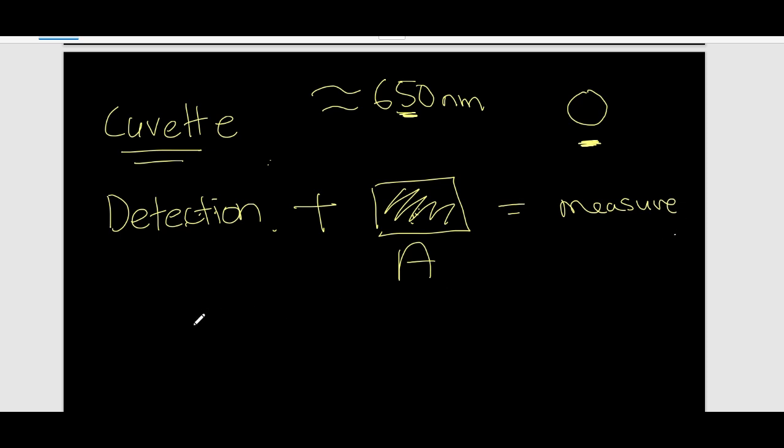I have written in your procedure to use 1 ml of detection agent and 2 ml of the phosphate or standard solution, which I can generally call the sample. So the sample should be 2 ml and the detection agent 1 ml.